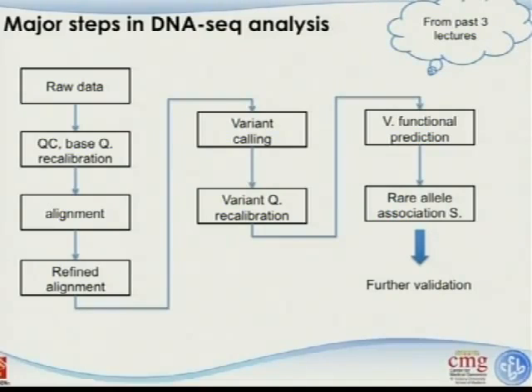And there are multiple ways to do that. Remember, if it's a diploid genome, which for human, for example, means we have 2 chromosomes, one from mom, one from dad, and if they are in a reasonably balanced design, half and half, then we can just use SAMtools to do that. It's pretty good.